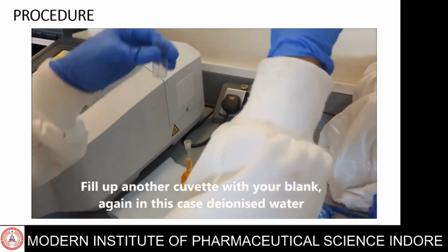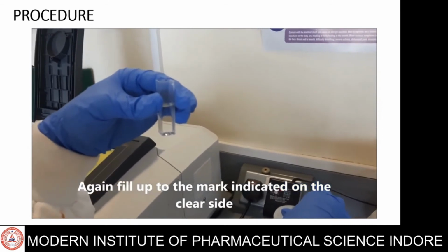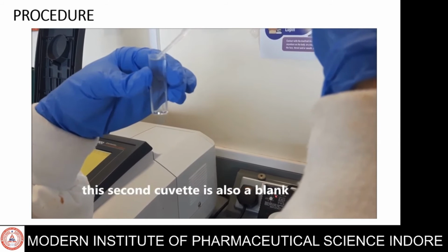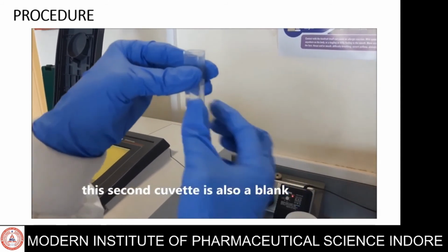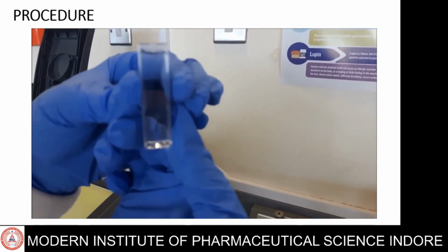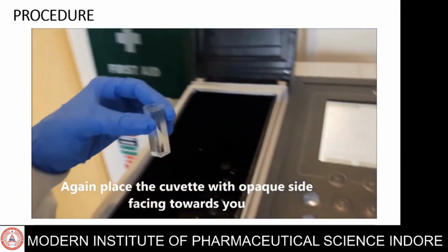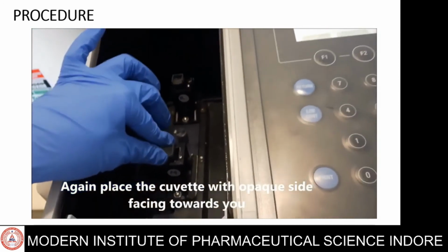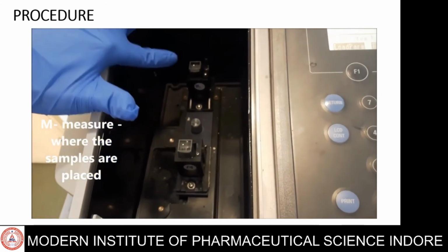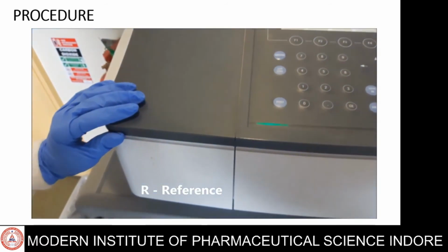Fill up another cuvette, which is the sample cuvette. Again fill up to the mark indicated on the clear side. The second cuvette is also blank. For baseline correction, we have to fill both cuvettes with the same solvent for baseline correction and initialization of the UV visible spectrophotometer. Again, place the cuvette with the opaque side facing towards you. Measure where the samples are placed.